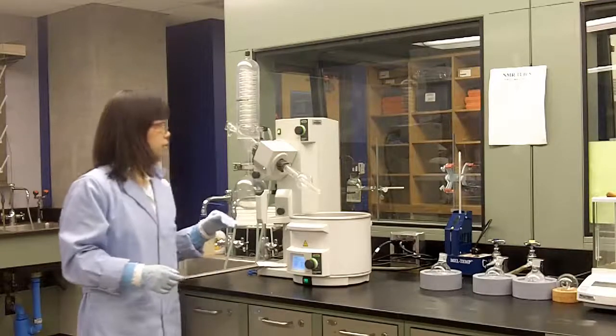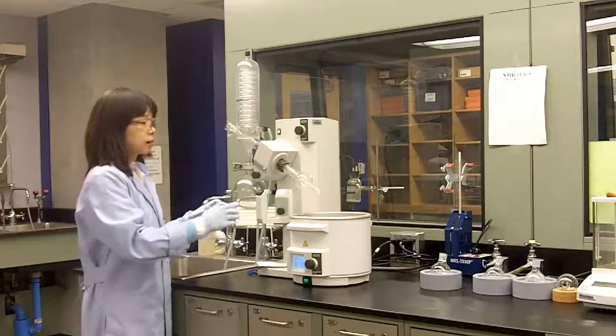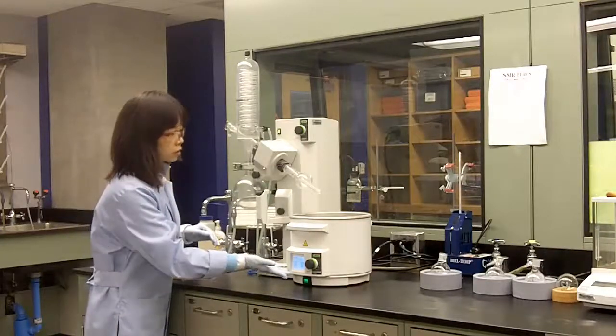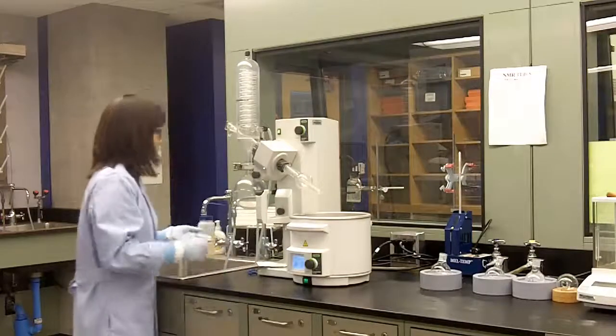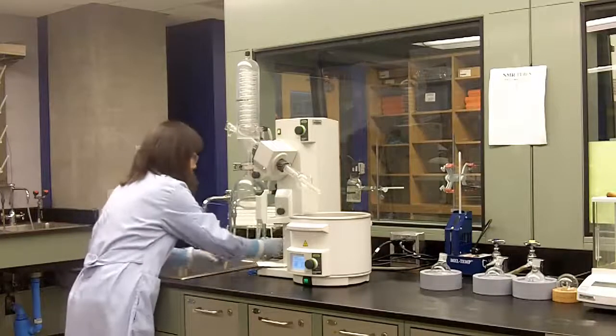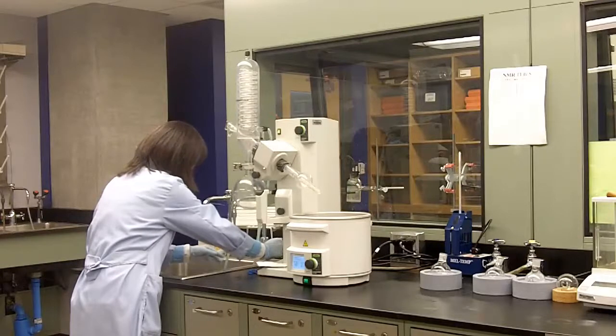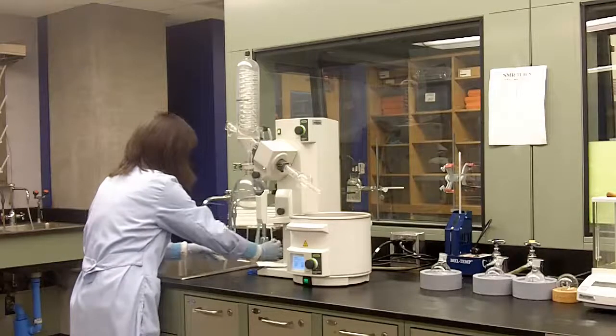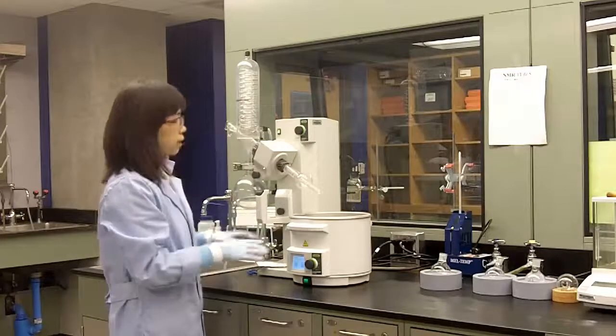Now let's talk about the steps to operate the rotary evaporator. Before you start evaporating any solvent, make sure your warm water bath is on. Typically the temperature is about 40 degrees. Also make sure the cooling water for the condenser is on. Okay, now we have the rotary evap ready.